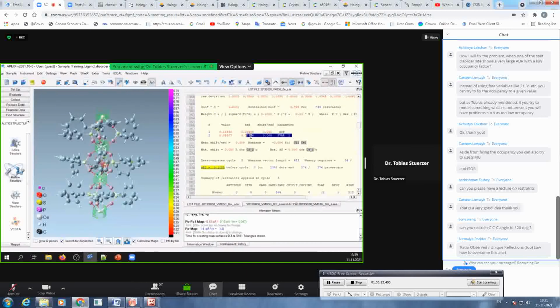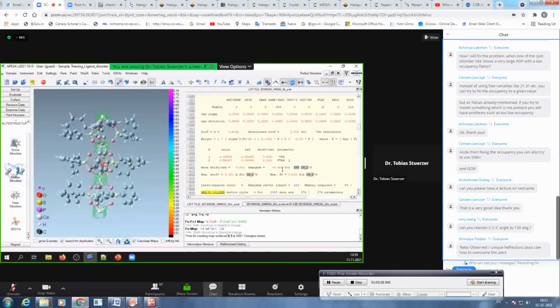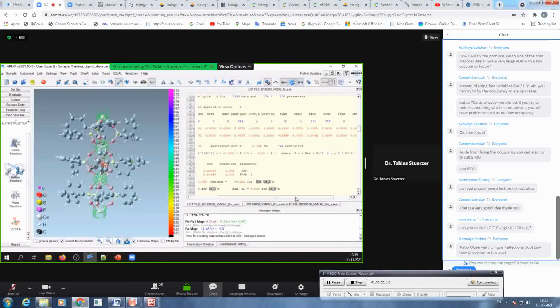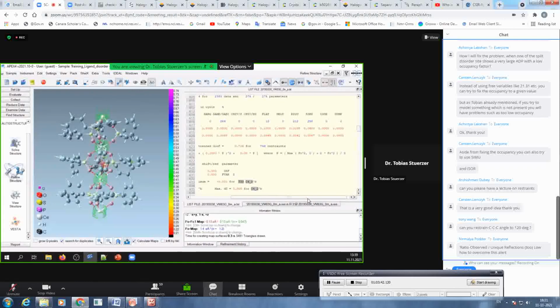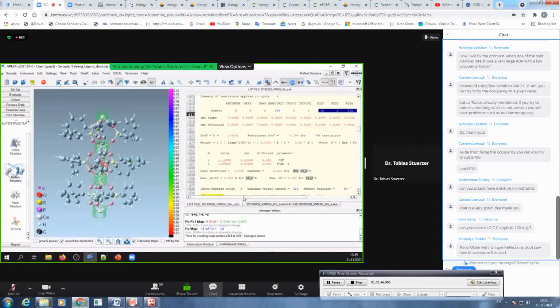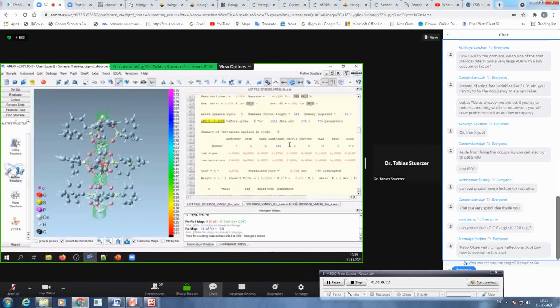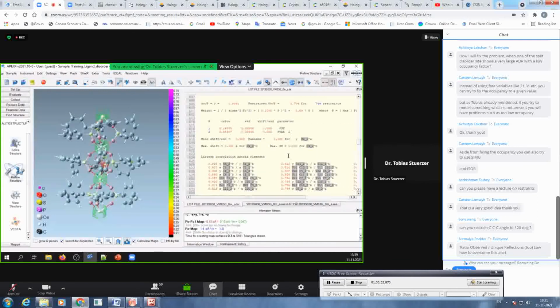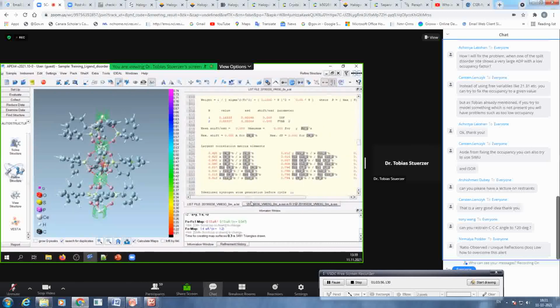Then the refined parameters, next to the atomic parameters with standard deviations, some info on the restraints, summary of restraints in the different cycles. So you see here, where is it? Oh, it's just too far away here. RIGU, DELU, FLAT, 12 FLAT restraints, the sigma and the deviation. So there's a lot in this listing file. It's sometimes quite interesting to read that.